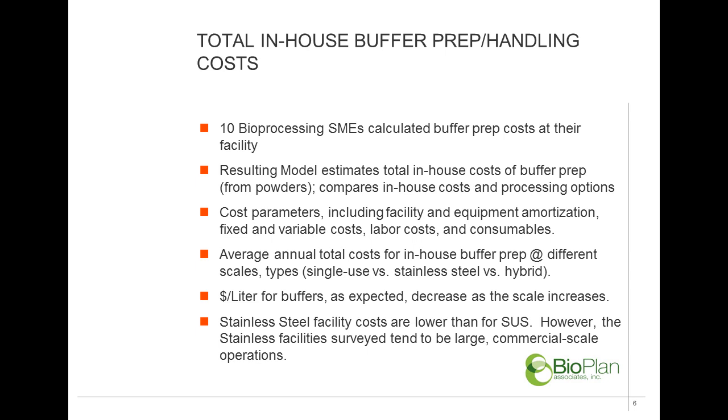So just to revisit, when we look at the total in-house buffer prep handling costs, this analysis used 10 bioprocessing subject matter experts, and we used that input to calculate the buffer prep cost at their facilities. The resulting model estimates essentially the total costs of buffer prep from powders, and it compares those in-house costs and processing options. The cost parameters, including the facility and equipment amortization, fixed costs, and variable costs, allowed us to tease out labor costs as well as, of course, the consumables.